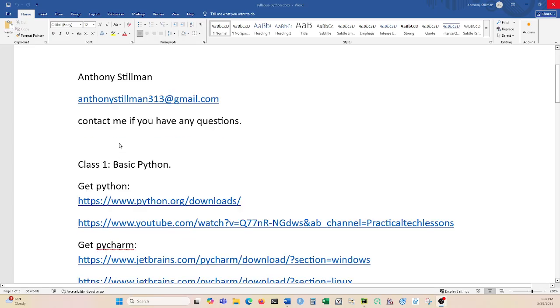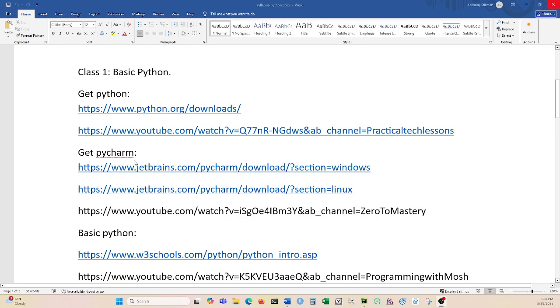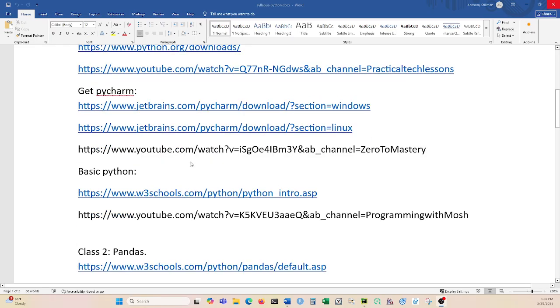And let's get started with the basics of the course. First class, which is this class, we're going to be going over basics of Python, which is installing Python and then installing PyCharm, which we'll get into later, and then the basic parts of Python programming.